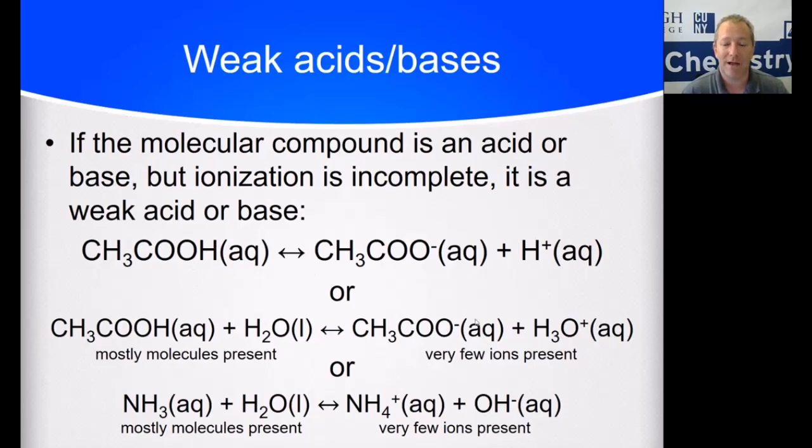It stays as the molecule. There are not very many ions present. The conductivity is going to be weak. In our experiment, we will see the light bulb only come on weakly. Okay, ammonia, weak base, same thing. Windex, window cleaner, stays mostly as molecules.